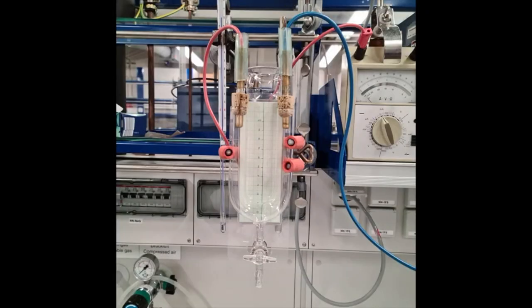The centerpiece of the apparatus consists of an open U-band to which a glass tube is attached in the band. The tube connects the U-band to a storage funnel.